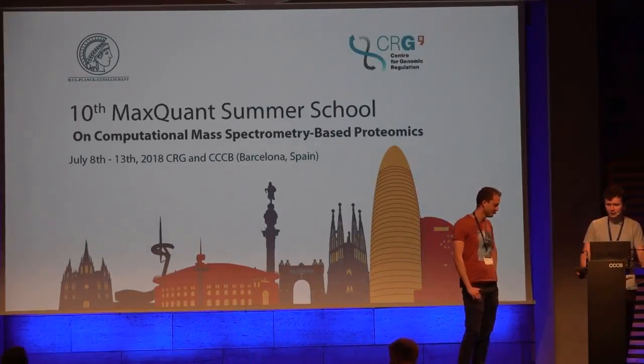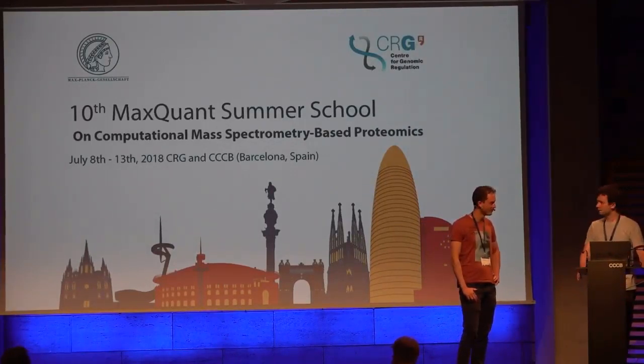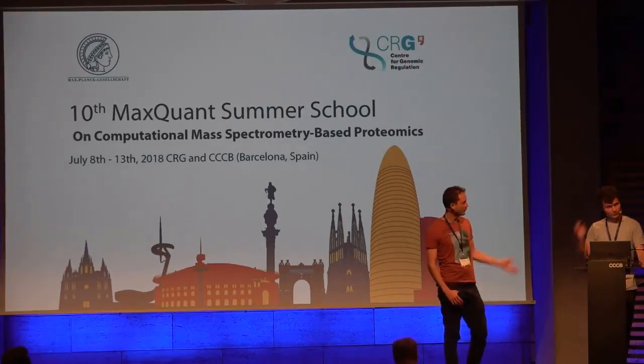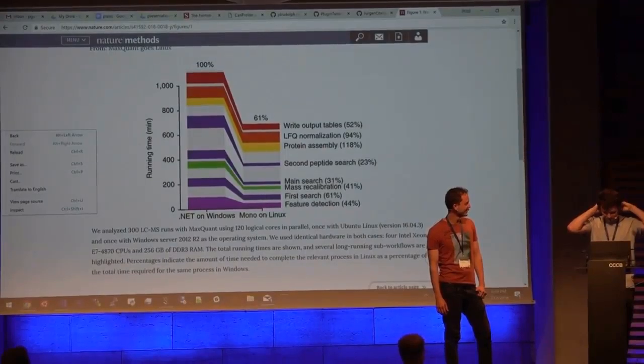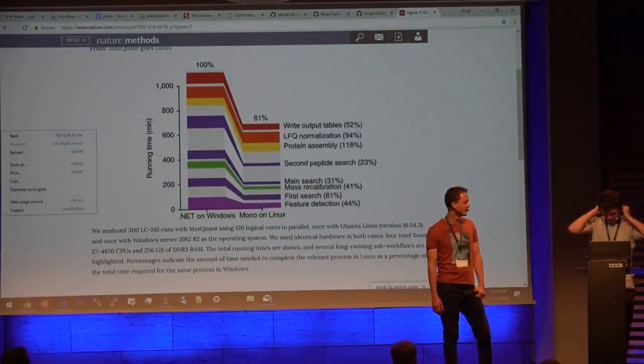Okay, so let's start. We can switch on screen. So Pavel, how many plugins did you already program? Do you know? I think I created one and changed a few.